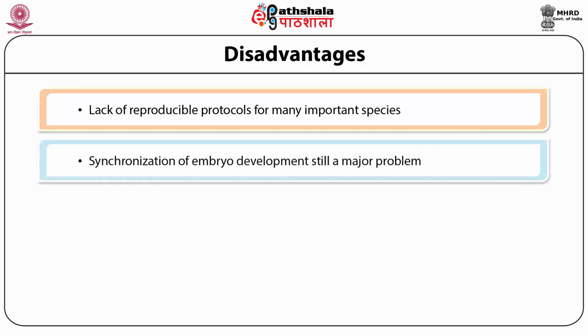The other major problem in the technology remains that embryos are at different stages of development. And embryo induction medium is different from the embryo maturation medium. So what happens is that your embryos are arising all the time. You don't know when to transfer that callus to the embryo maturation phase. So some of the embryos will go waste, which are very small, and the callus which still can form more embryos, but that way you are transferring it to the different media.